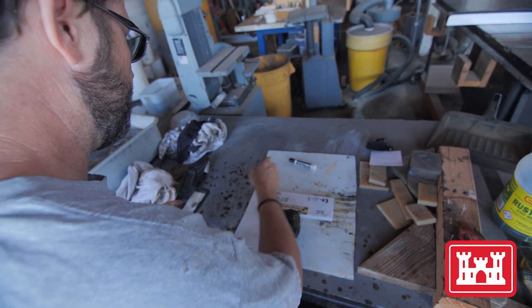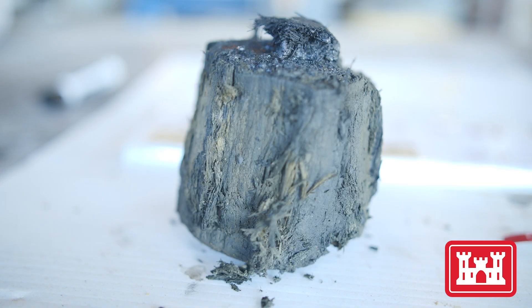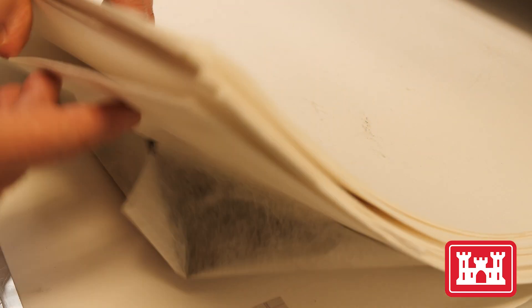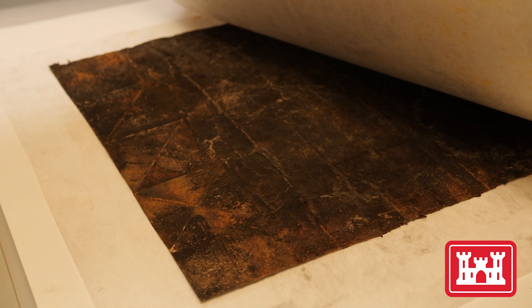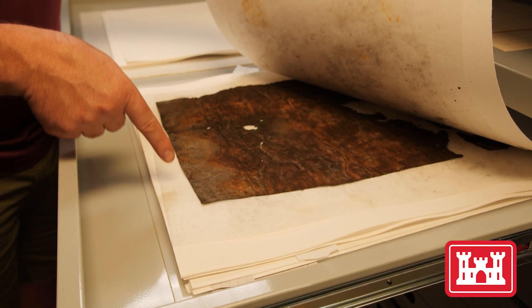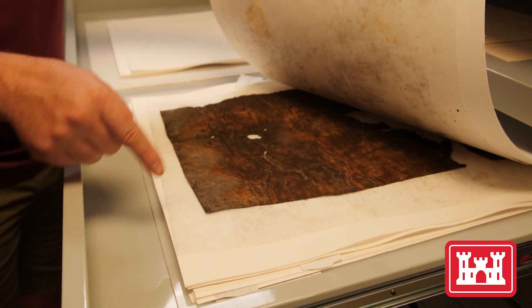All the contents removed from the cannon are carefully measured and photographed by the archaeology students who work at the lab, and each type of artifact requires its own special tender-loving care. Treating the paper for the charge bag, for instance, is a completely different process than we'd have to do for the iron. Different materials break down in seawater in different ways. The powder bags, made of two-century-old paper, are especially rare and required the team to create a custom conservation protocol. This is not something that survives very often, so we got really lucky on this. There are not very many examples of this. What we're doing is placing them between sheets of paper with blotting paper on top, so we can do a slow, controlled dry.